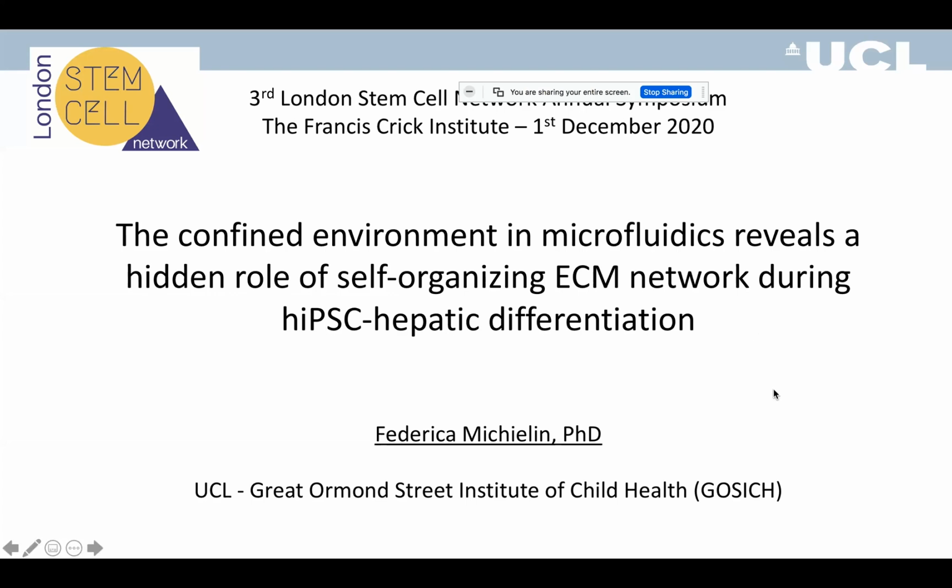I'm Federica Michielin. I'm a postdoc in Paolo De Coppi's lab at UCL, Great Ormond Street Institute of Child Health. And today I'm going to talk about my recent study about the role of the confined environment in microfluidics that reveals a hidden contribution of self-organizing ECM during iPSC hepatic differentiation.